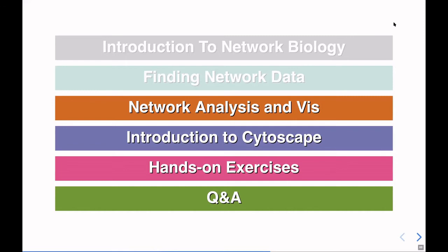When you do the enrichment in String App and bring up the enrichment, there's a button where you can choose whole genome, or you can select another network, and it will use the genes or proteins in that network as your background. So it's built into the String App, and when you run your enrichment, you have that option of choosing another network for your background as opposed to whole genome.